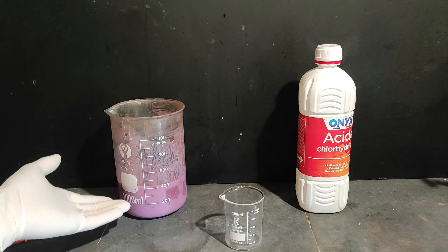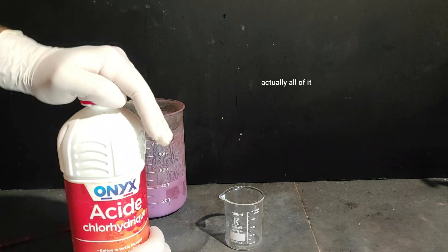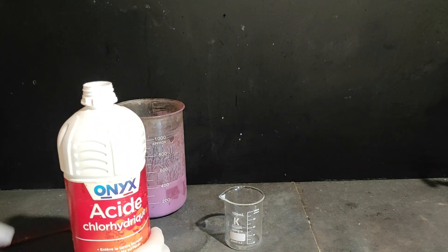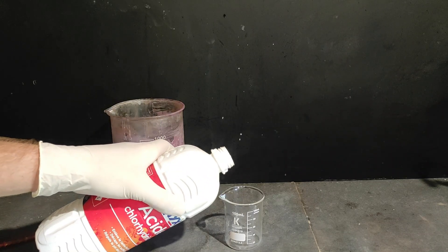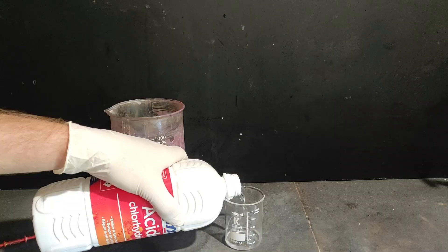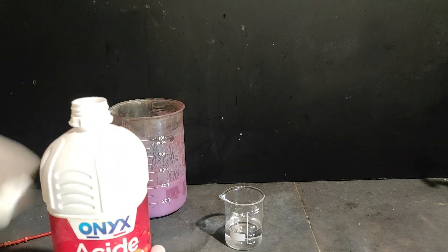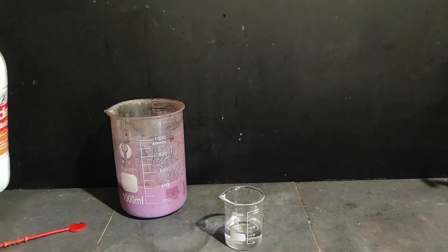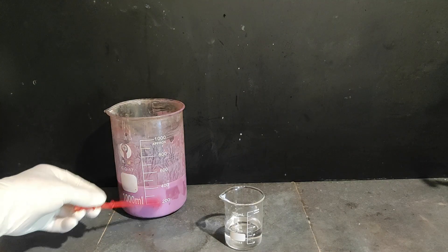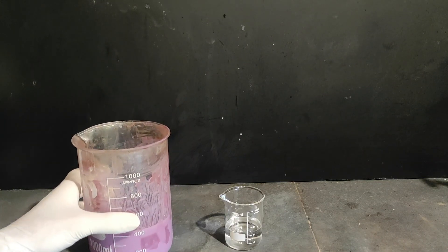Now that we have our decanted cobalt carbonate, we're just gonna convert some of it to cobalt chloride, which we'll need for the synthesis as a catalyst. First off, I'm gonna add about 40 mils of hydrochloric acid to this beaker — it doesn't have to be precise. Then I put it aside and drop in random bits of cobalt carbonate until it doesn't dissolve anymore.